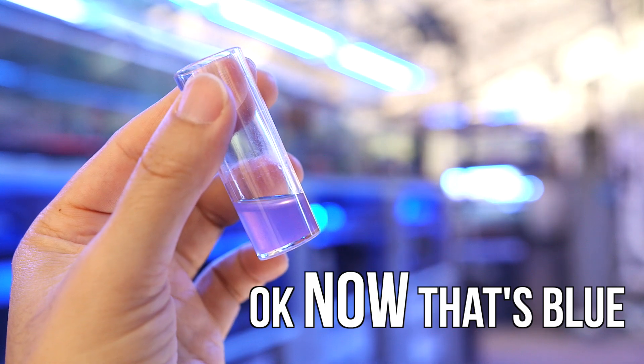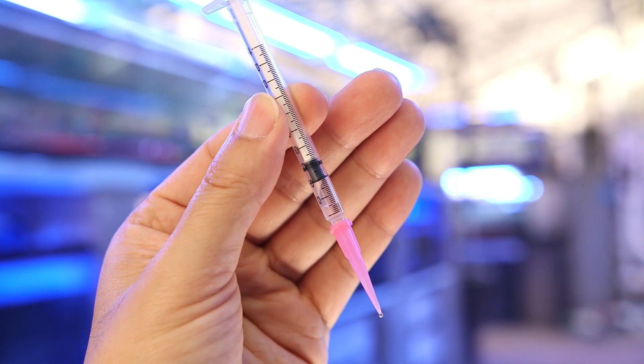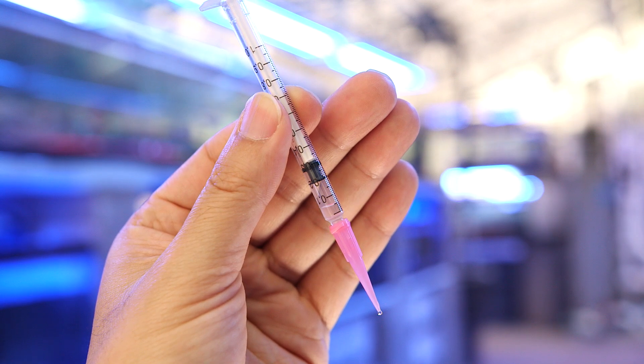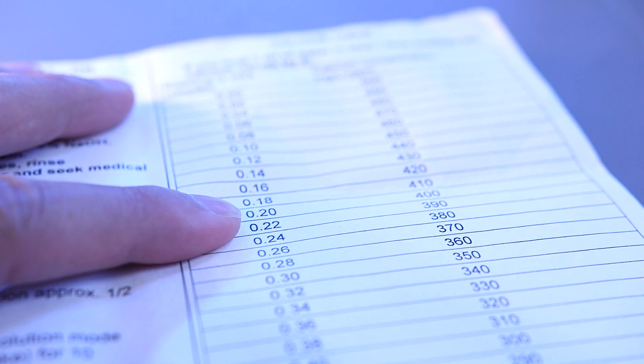And there we have our color change. Now to determine what the calcium level is, take a look at the syringe and see that it's now at the 0.2 mL mark. So we've put in 0.8 mL into the sample before that color change. Referring to the instructions, we can see that a reading of 0.2 means that there is 400 parts per million of calcium in our tank. It's a tad low but nothing to really freak out about.